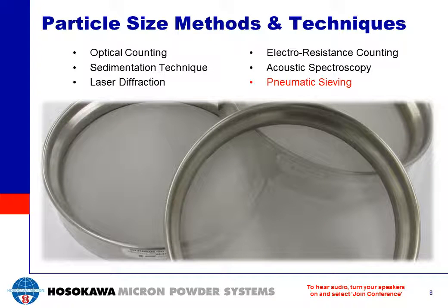There is a vast array of analytical techniques and equipment to determine the particle size distribution. In selecting the analytical technique or the particle size equipment, you must clearly understand the target or scope you're about to measure and the purpose of this measurement.